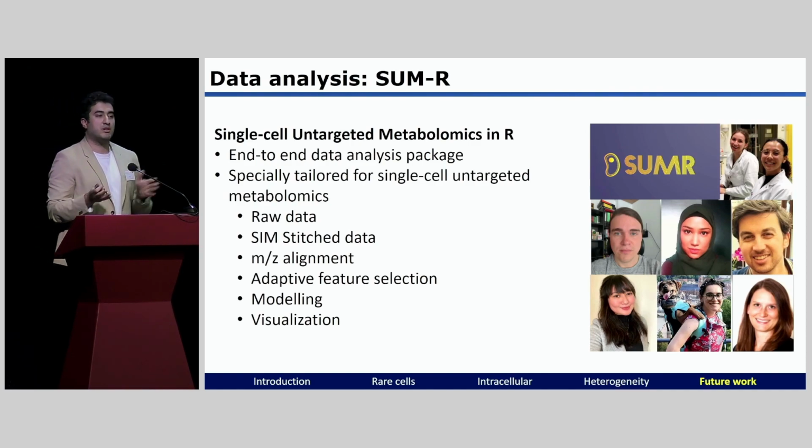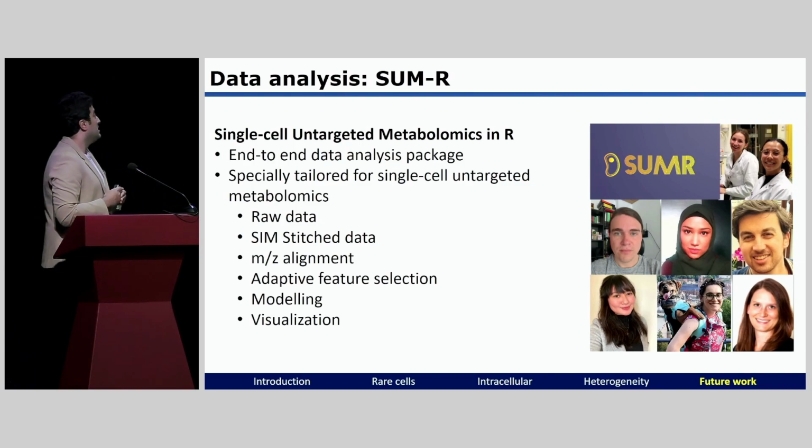We basically want to start from right where we get our raw data. So we use very high-resolution instruments. We also do a lot of tricks on how we get even the data. So we really need to have a specialized solution. And then it will do the modeling, the visualization, everything, and also the alignment.